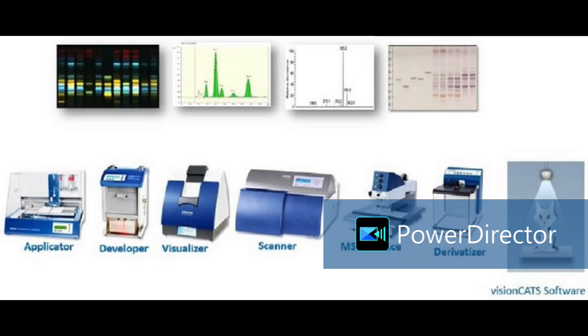We have captured the absorption spectra of caffeine here in track number 3. That caffeine is in the library. It is showing exact correlation and possible hits. It is showing possible components, hit 1, 2, 3, 4, 5, 6, 7, 8. So the first hit is caffeine.